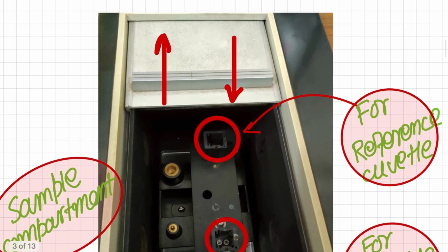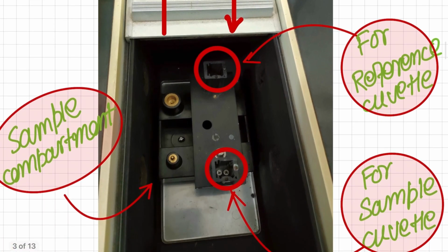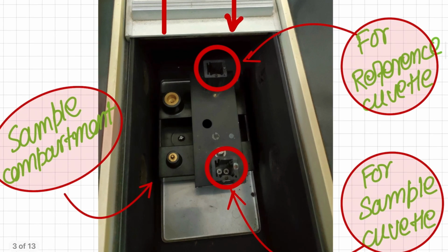This sample compartment is covered with this cover, so we slide down this cover to close the sample compartment, and then the analysis will be performed in this closed position.